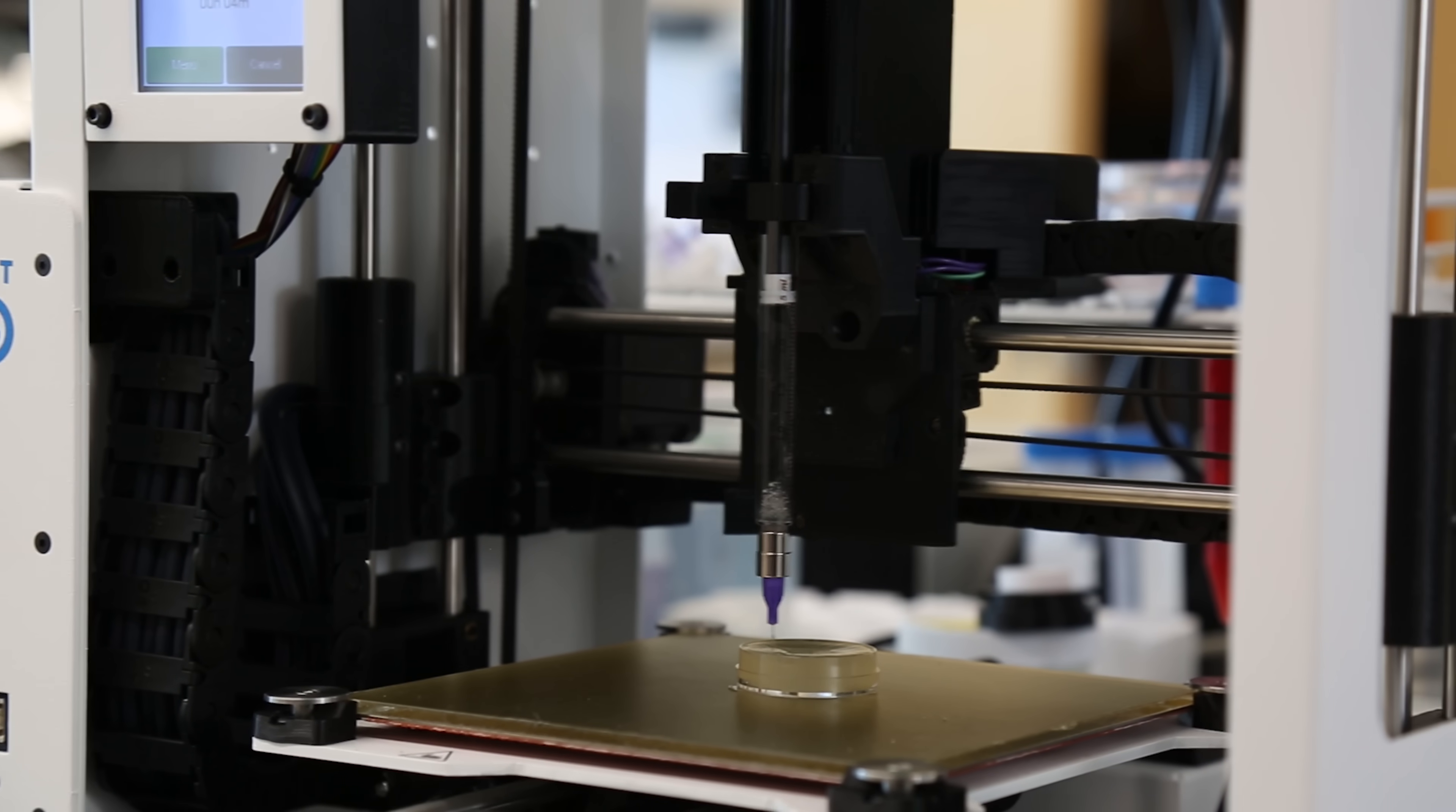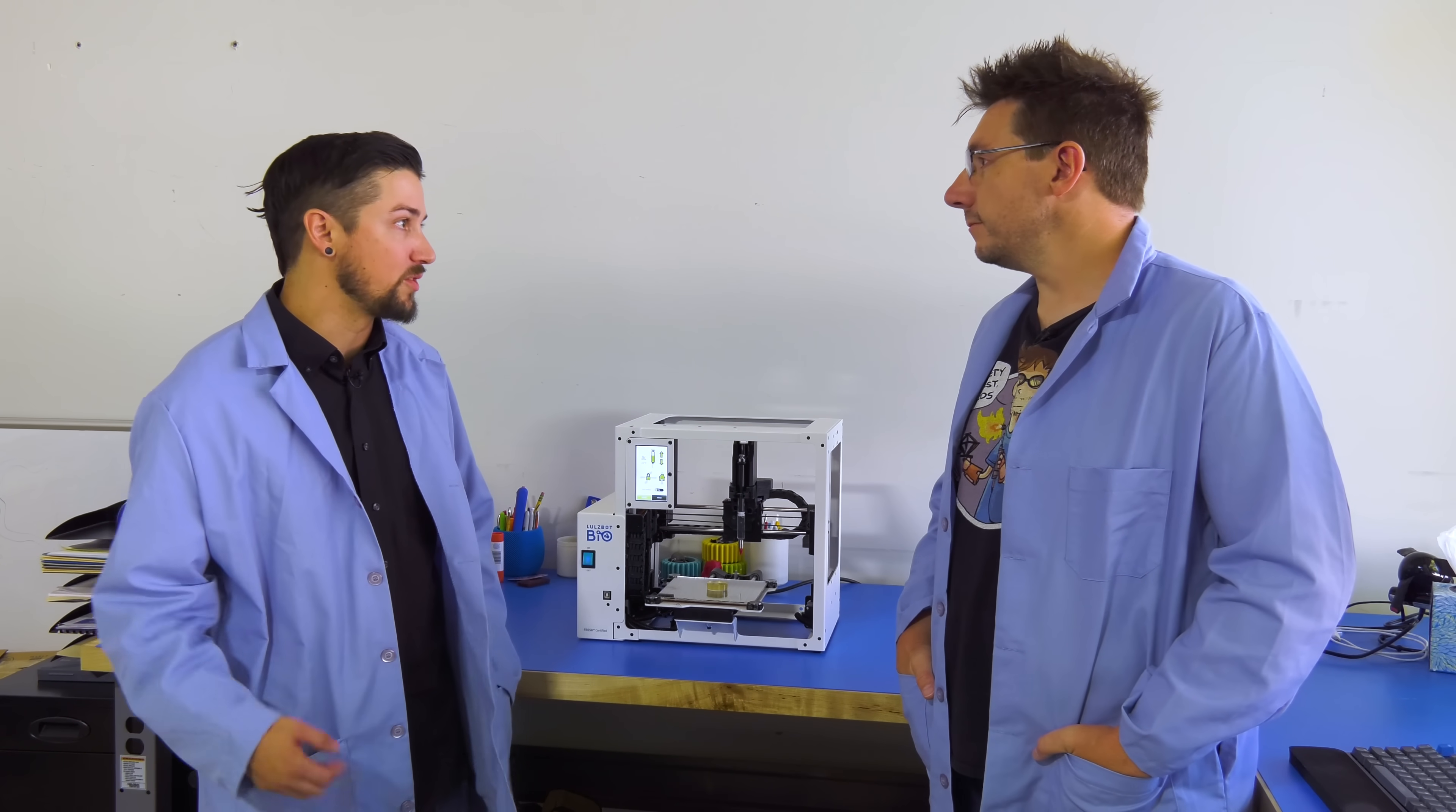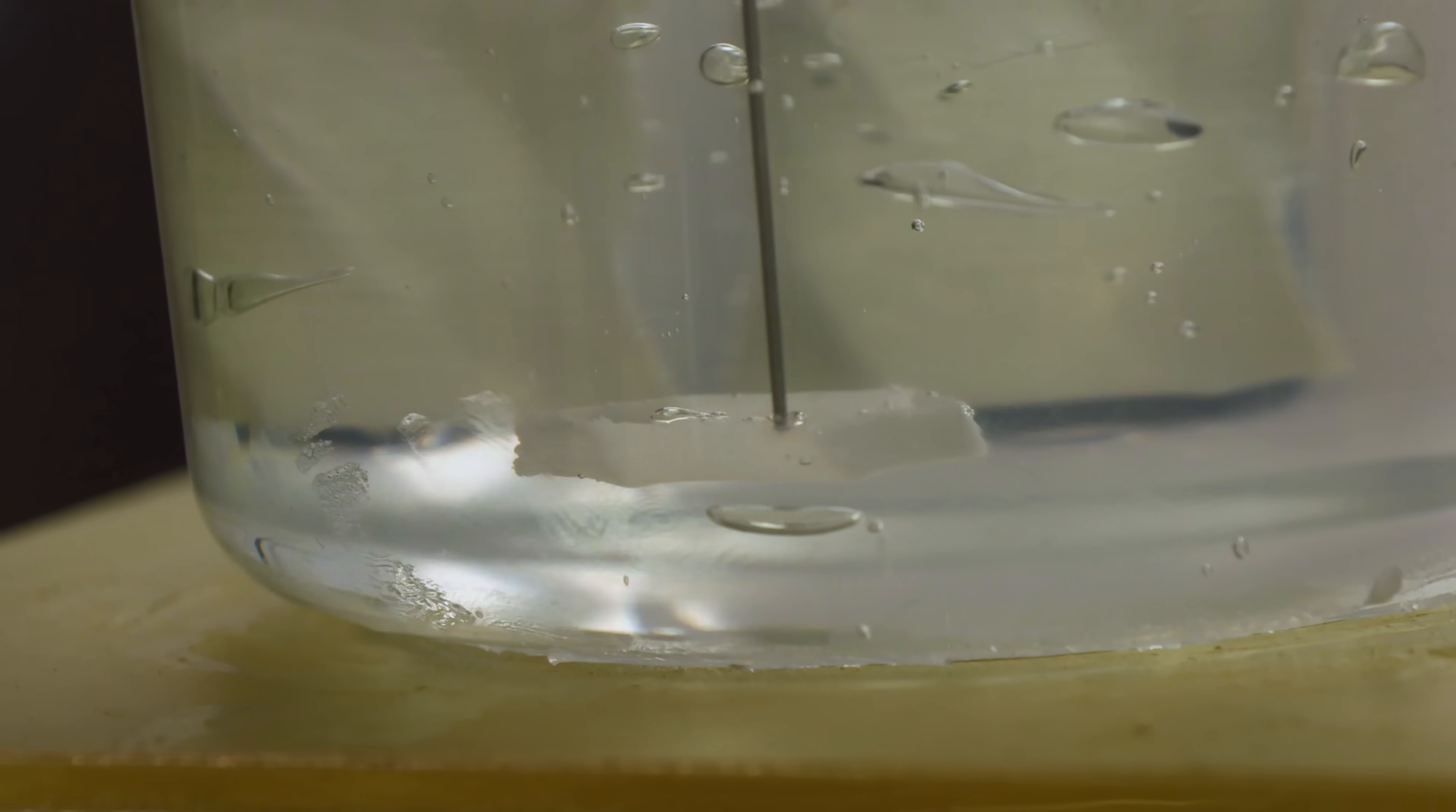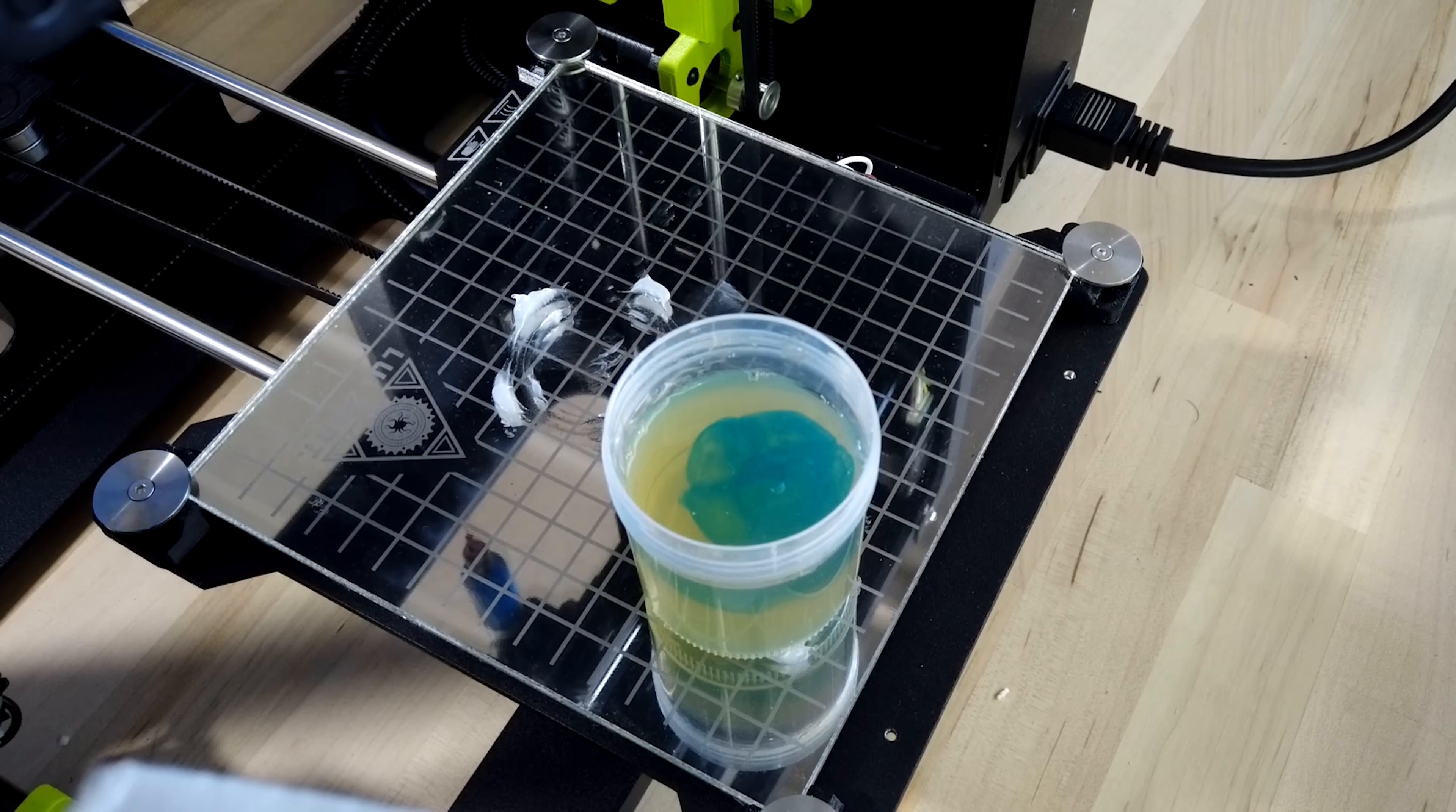So this is a LulzBot Bio. It is a FRESH certified 3D printer for printing unmodified collagen, bio inks, and other soft materials like thermosets. What does FRESH stand for? Freeform Reversible Embedding of Suspended Hydrogels. That's a lot of words. Basically, it is suspending a bio-type material or soft material into a gel. When you're done printing, you actually heat that gel up, and it will turn back into a liquid and release your print.